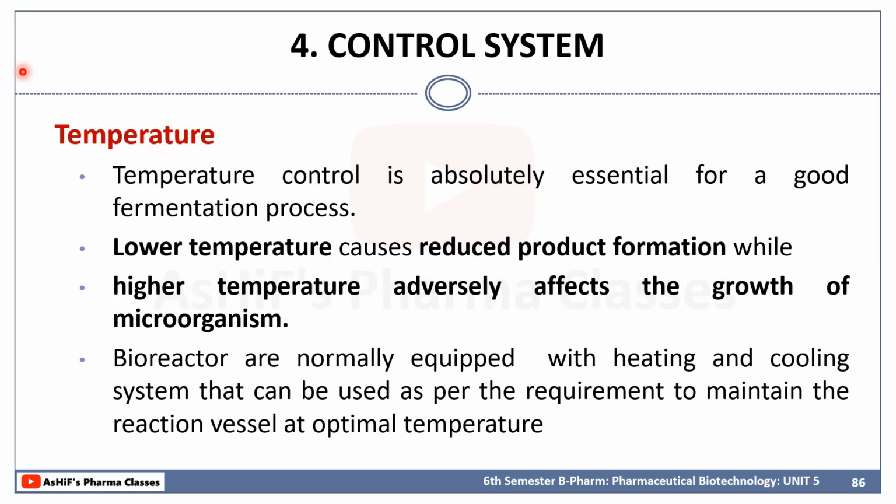Now coming to the second factor, that is the temperature. Again, temperature control is absolutely essential for a good fermentation process, since lower temperature will cause reduced product formation, and higher temperature will cause an adverse effect on the growth of microorganisms.